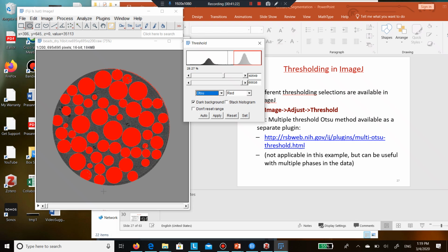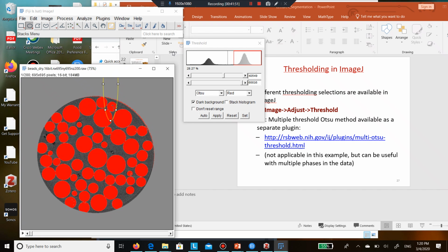The fact that your default is black or white will save you here, because you will not get this behavior that I do. You somehow switched to RGB. This now is red, green, blue because it has obvious red. Did you at some point try to threshold this?